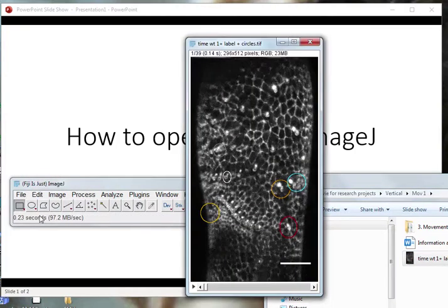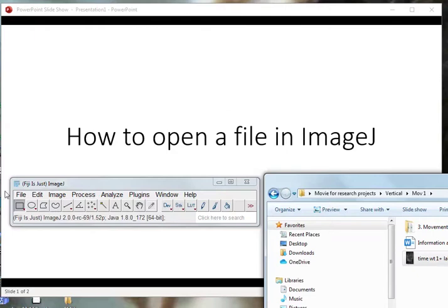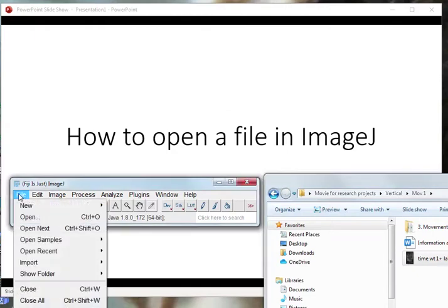Very straightforward, you have the file open. Another way to do it is also go to File.